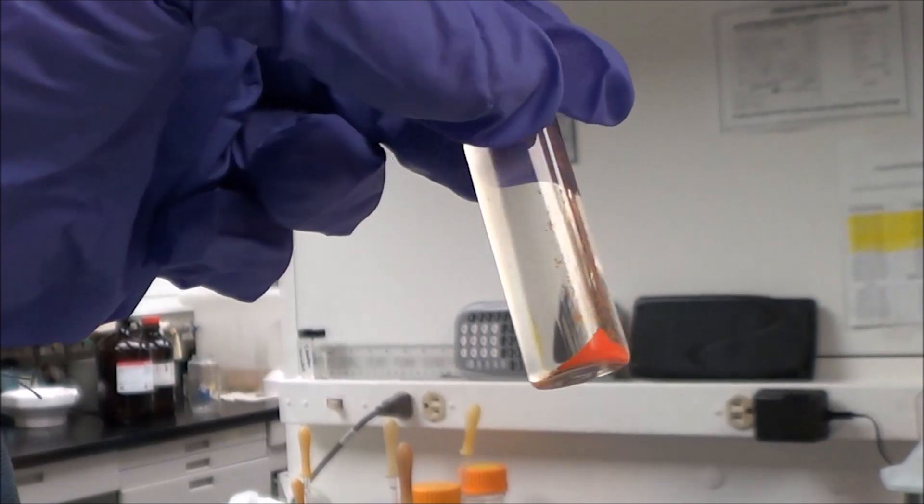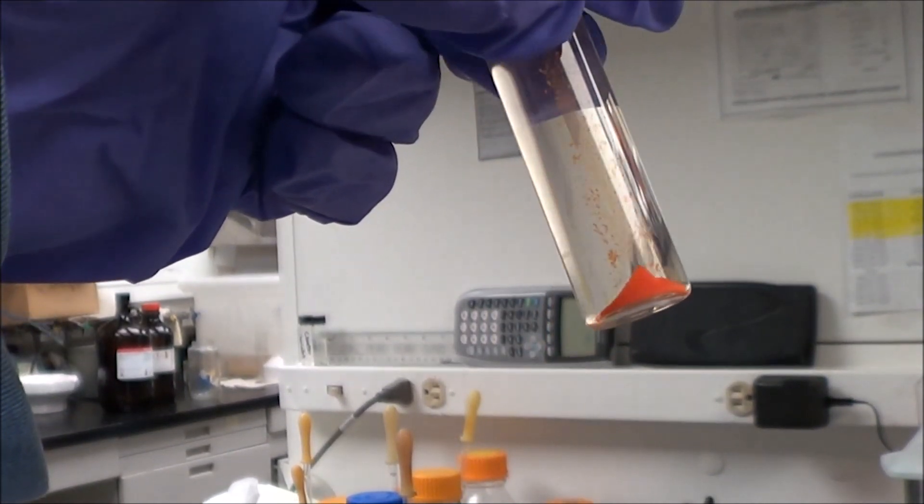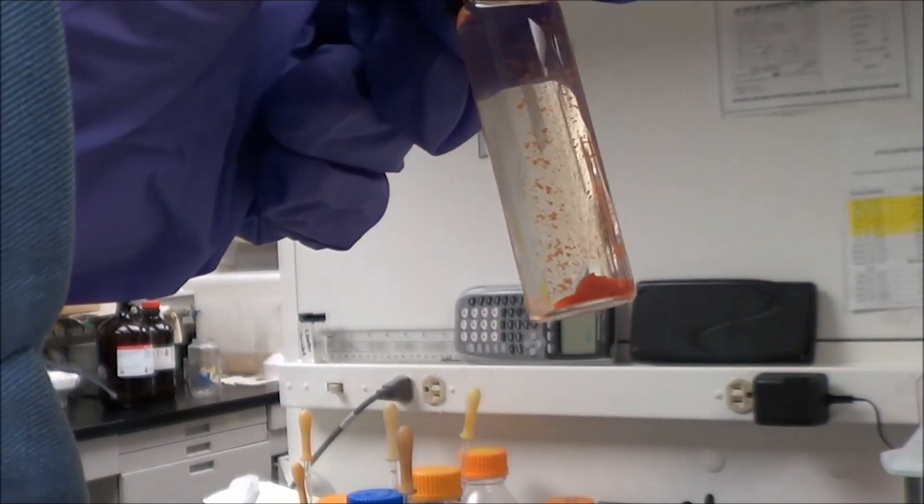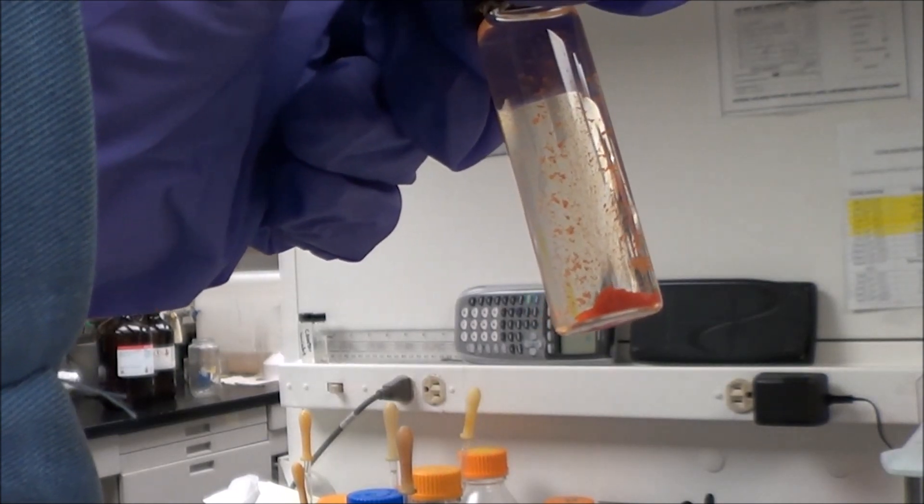Then what we do is we take the hexane with dots, add isopropanol and methanol or ethanol, centrifuge, and now you can see that we've got a clean precipitation.